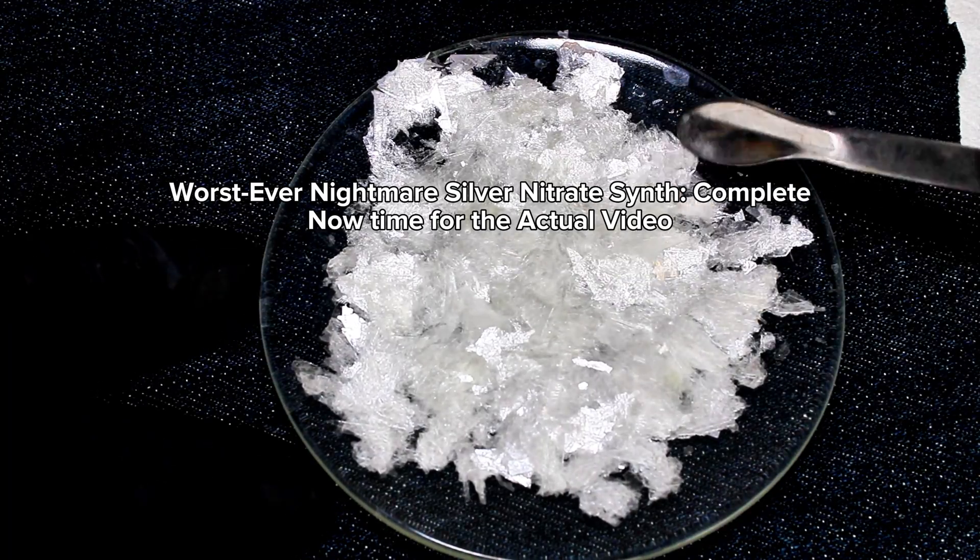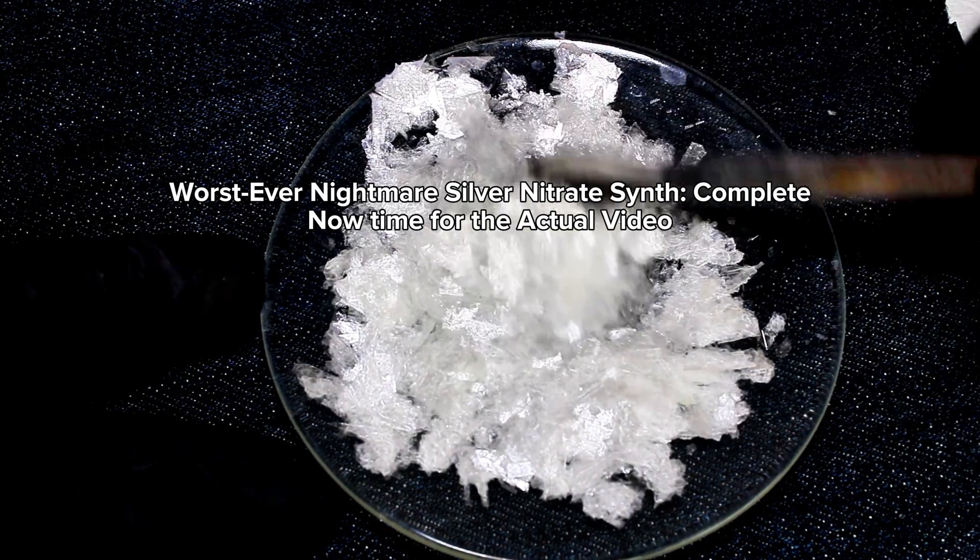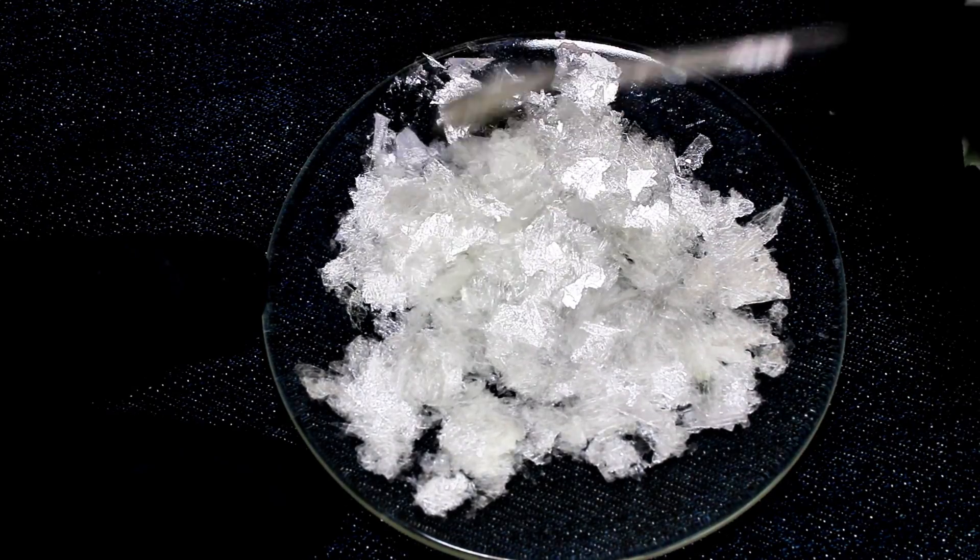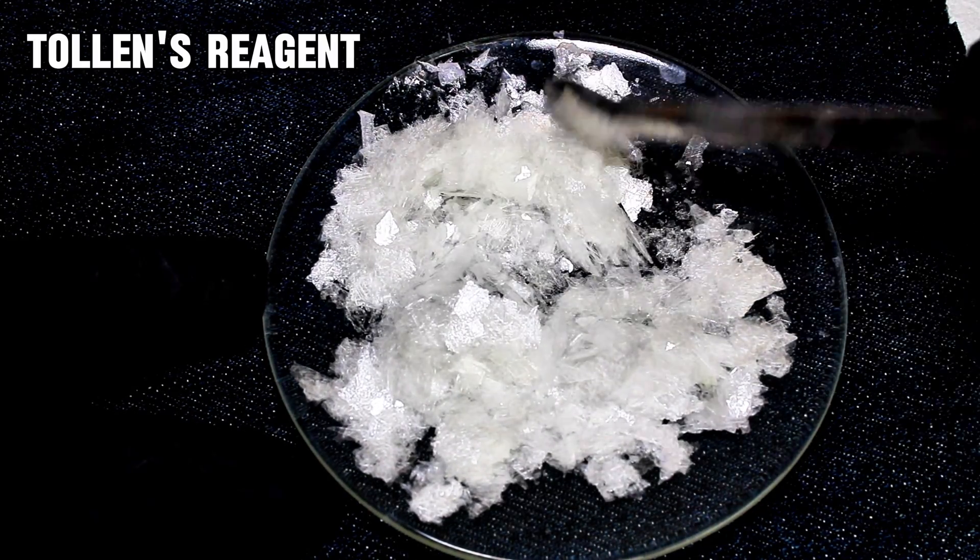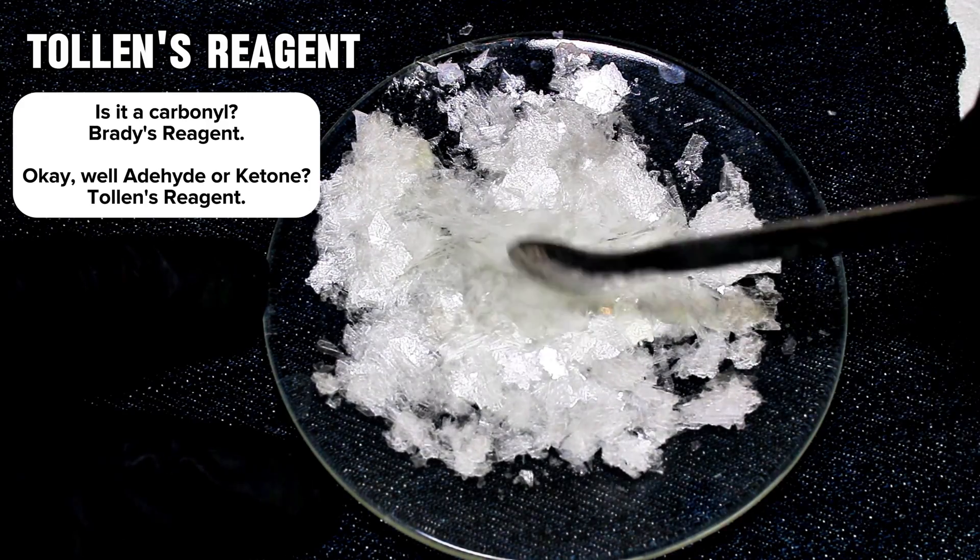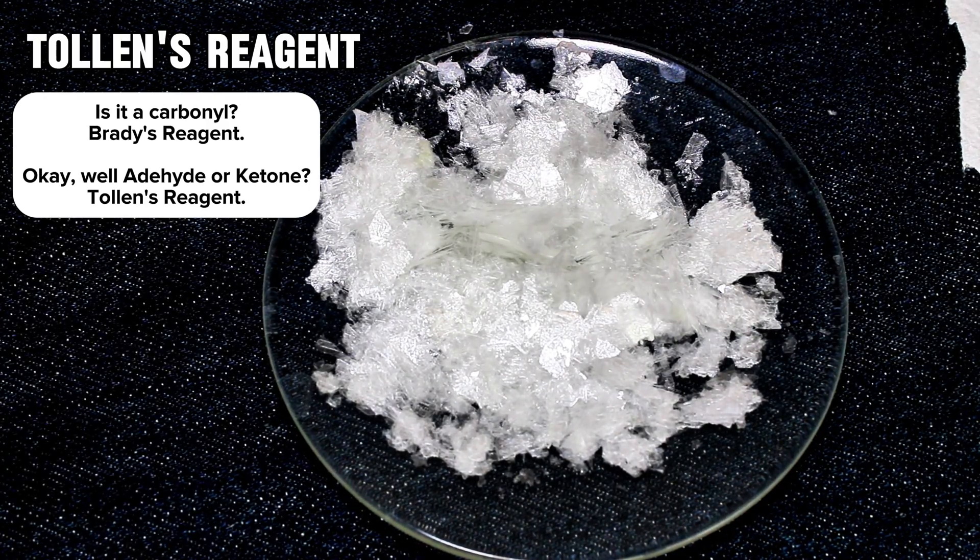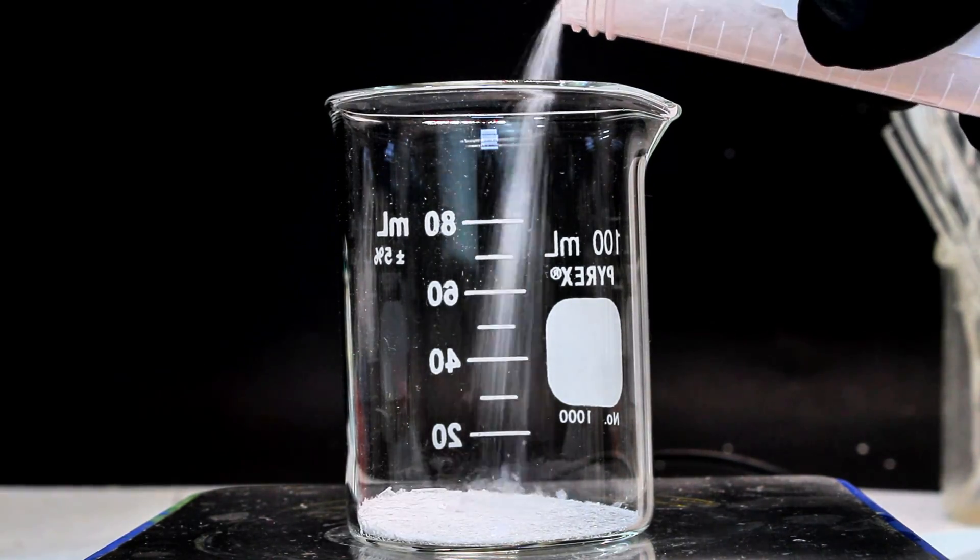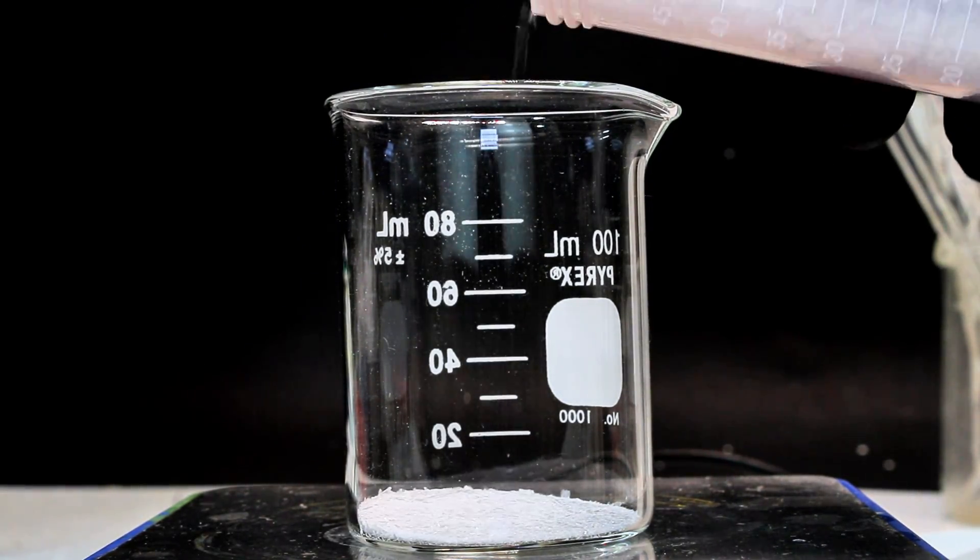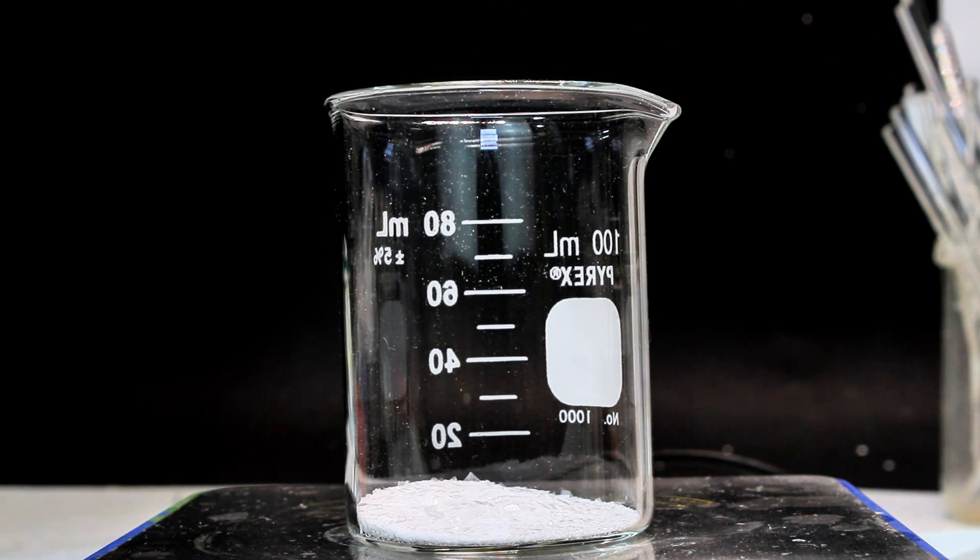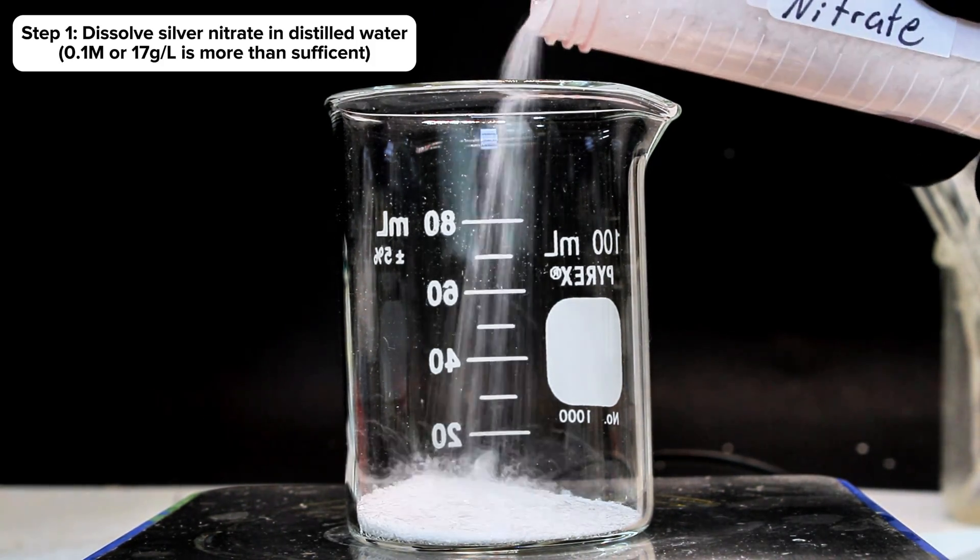Anyway, now that I've finally prepared some silver nitrate, it's time for the silver mirror. Silver mirroring is applied using a mixture of chemicals called Tollens reagent. Tollens reagent is used mostly in analytical chemistry to distinguish between aldehydes and ketones after a carbonyl group has been identified using Brady's reagent. I'll come back to this in a minute, and in the meantime, to make some Tollens reagent, the first thing I needed to do was to re-dissolve some of my silver nitrate in a small amount of distilled water.